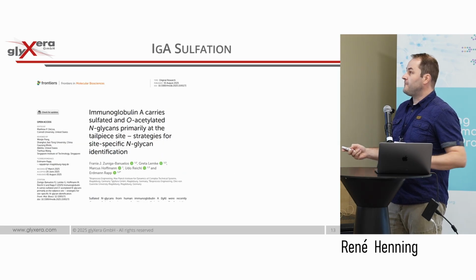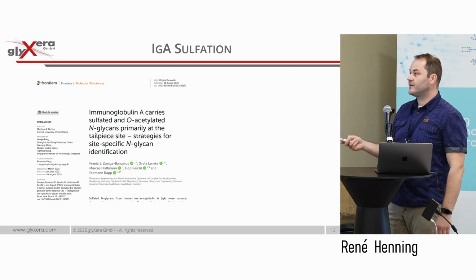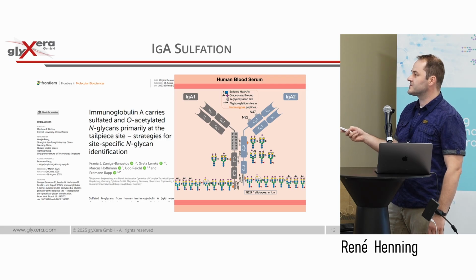So nice. And while Lea was doing her work and was producing the enzyme, there was also another publication of ours coming out from Franja, where they also looked at the glycopeptides. And at the end, Franja and Marcus could annotate and show exactly where the sulfate is attached, to which site.